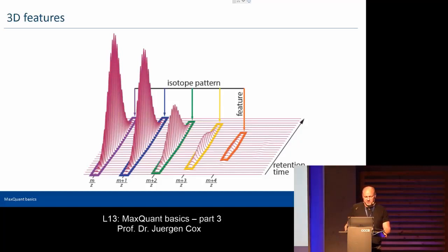And so the difference here to what you saw yesterday is that now we also have to make the mass recalibration dependent on the ion mobility dimension. So that's actually a huge contribution to the nonlinear mass error, and so we do actually recalibrate dependent on the ion mobility index or on the collision cross section.